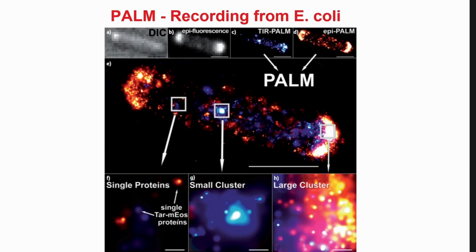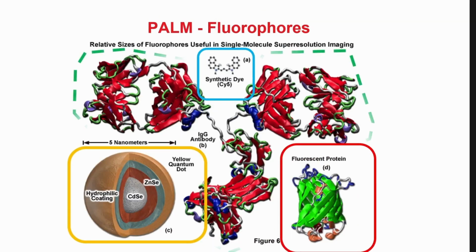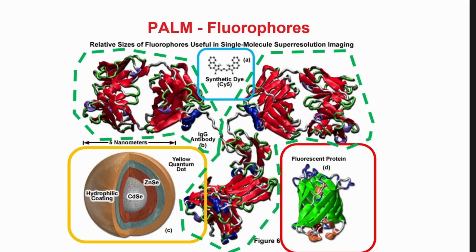Again, you can have a model and run it and try to estimate how many molecules there are and where they are, but it becomes more and more difficult. So the best is if you have single spots, single molecules, and then you fit your Gaussians on it, and then you get your high resolution.